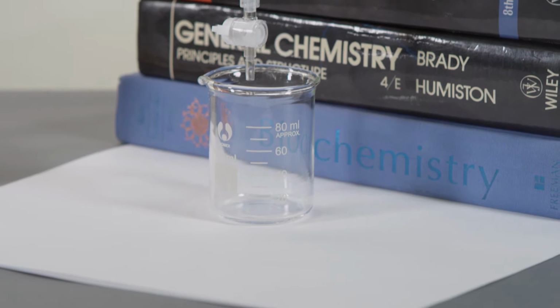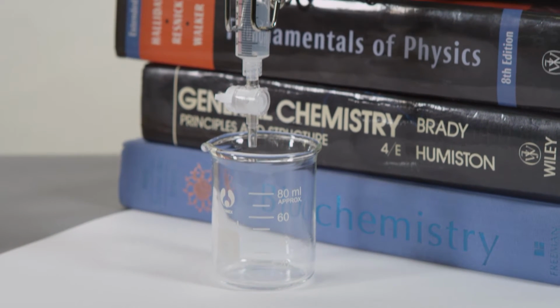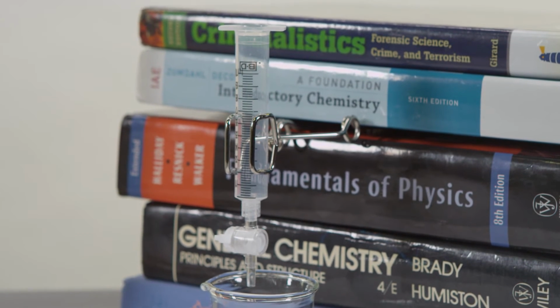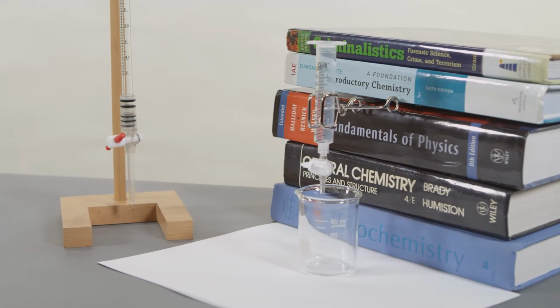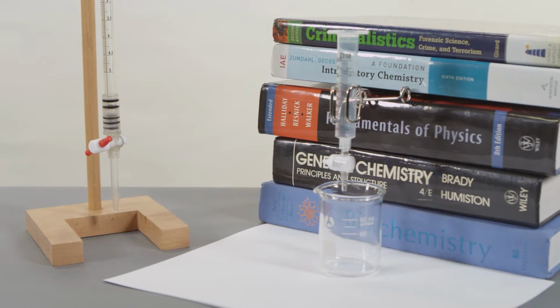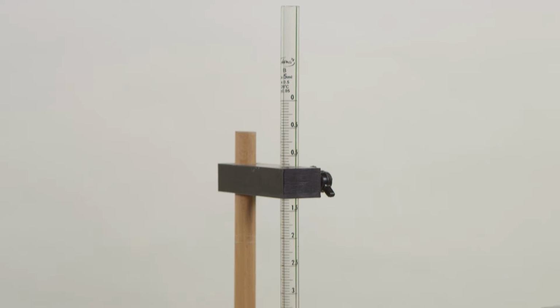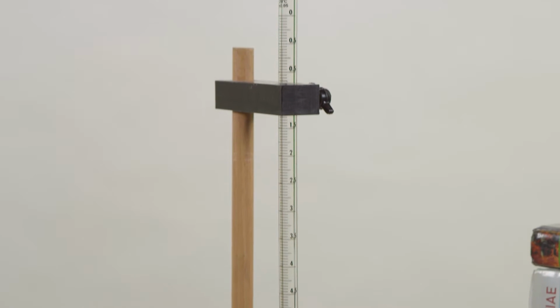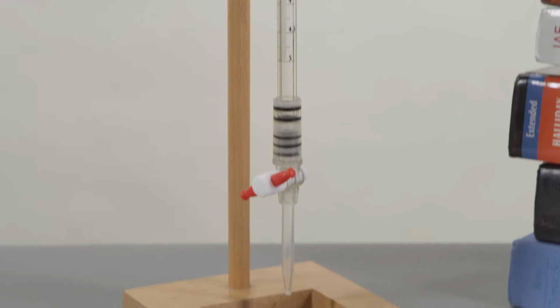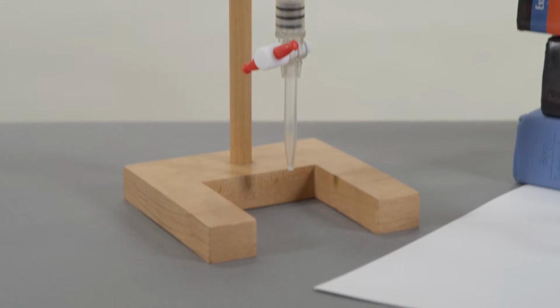Titration is a technique where one solution is used to analyze another. More specifically, in a titration, a volume of a solution with a known concentration is held in a burette and delivered into the solution being analyzed. This is an example of a burette that you might see in a laboratory. A solution is added to the top of the glass tube and is dispensed through the stopcock.